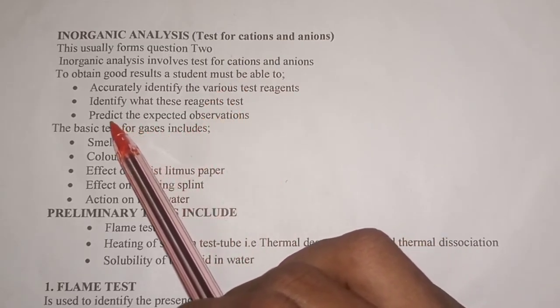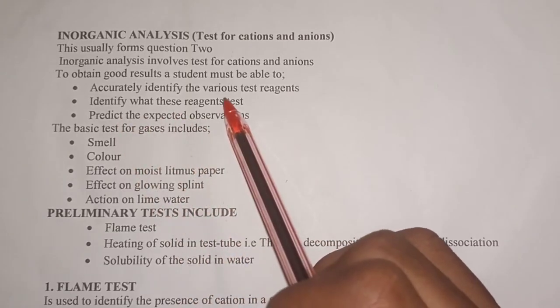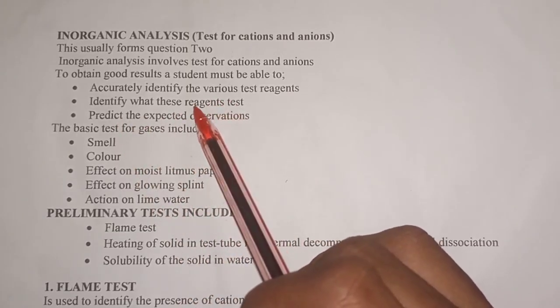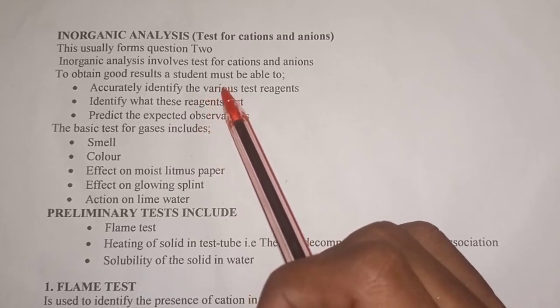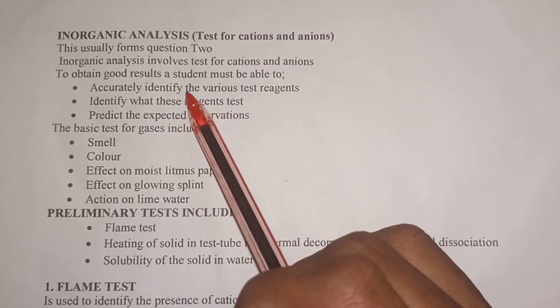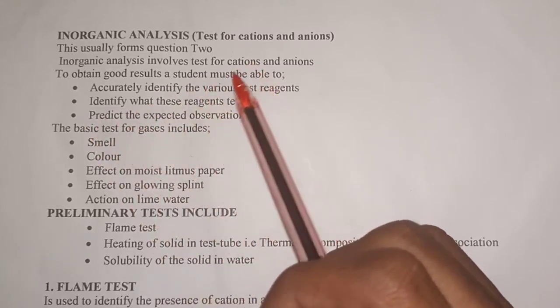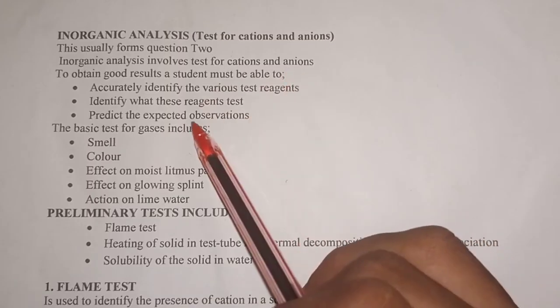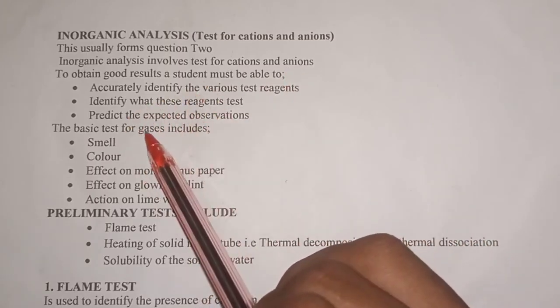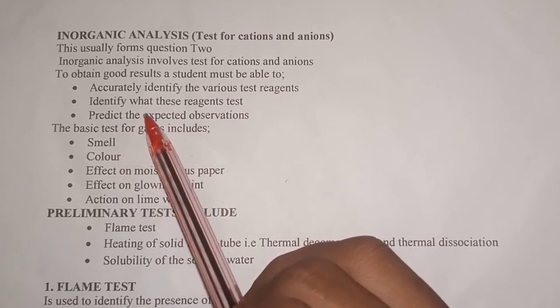And then after doing so, you must be able to predict the expected observation. Once you use sodium hydroxide to test a certain sample, you must be able to predict the expected observation. Will you get a white precipitate soluble in excess, or will you get no white precipitate, or will you get a white precipitate insoluble in excess, such things.